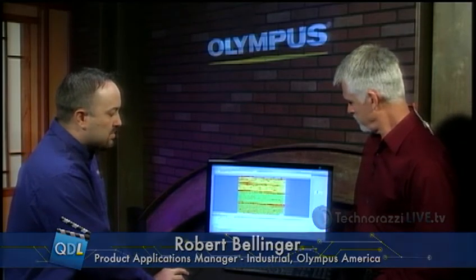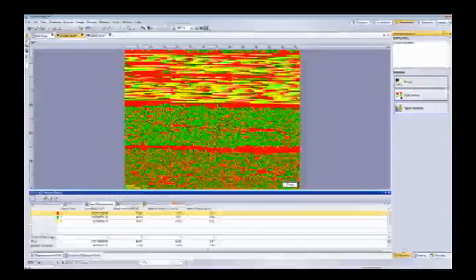Another thing to point out in the Stream software: the Count and Measure solution covers everything — phase, particle sizing, a group of everything. But if a customer is doing one specific type of thing, we have those broken down into individual solution modules like porosity, phase analysis, or particle distribution. These focused solution modules make it a little easier for the user interface, coming out with just the focused results they're looking for. It's a much simpler, large-button interface. It can also batch process large amounts of images through databasing or file formats. This is the Olympus Stream software, with Count and Measure and the other solution modules: porosity, phase analysis, and particle distribution. They all do similar functions.